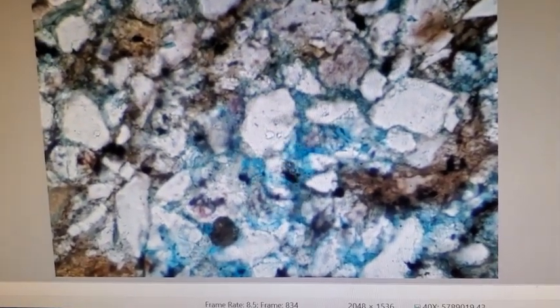Right? And you can see all the sand grains here. And you see all these frosty bluish areas that are pores, spaces in between the grains. And in this case, they're fuzzy because there is a lot of clay filling it, which is often light colored, and you can still see straight through it.